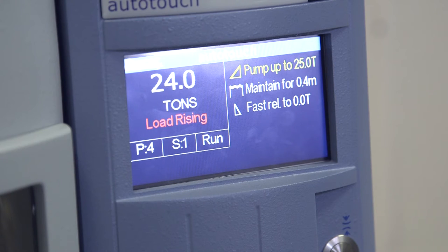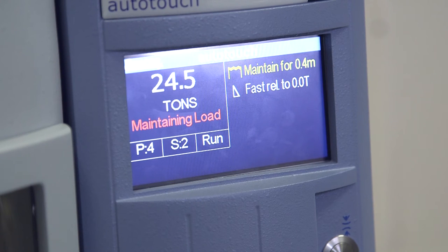One of the key benefits of the Atlas Autotouch presses is the ability to maintain load and the Autotop-up feature. Part of the press's built-in functionality is that it will sense when a sample has dropped off. For example, when making a thin film, you can maintain the load throughout the duration of the cooling process.